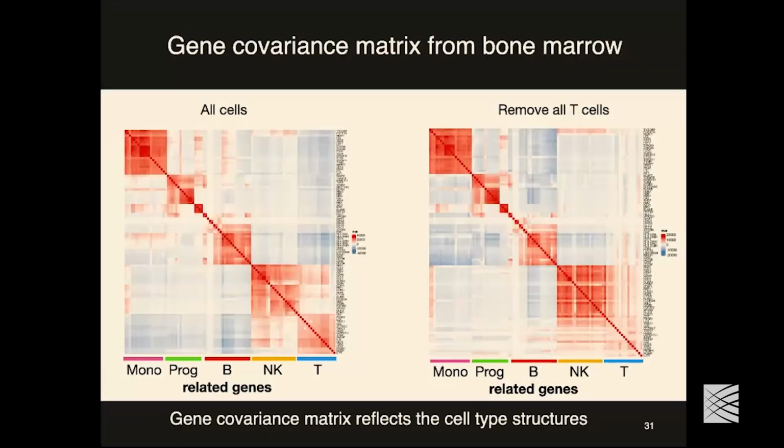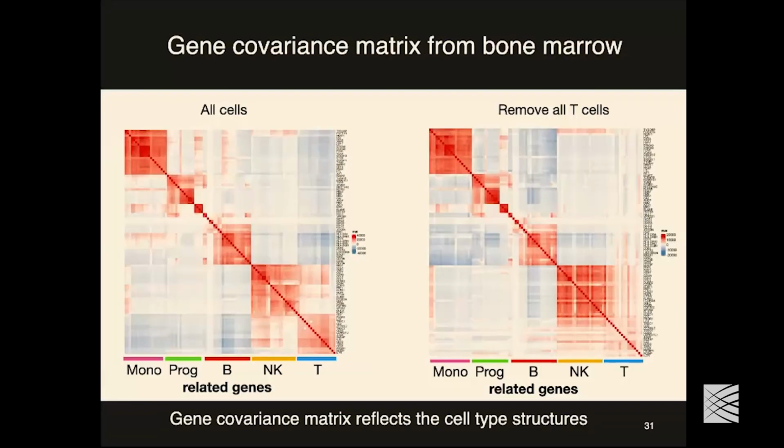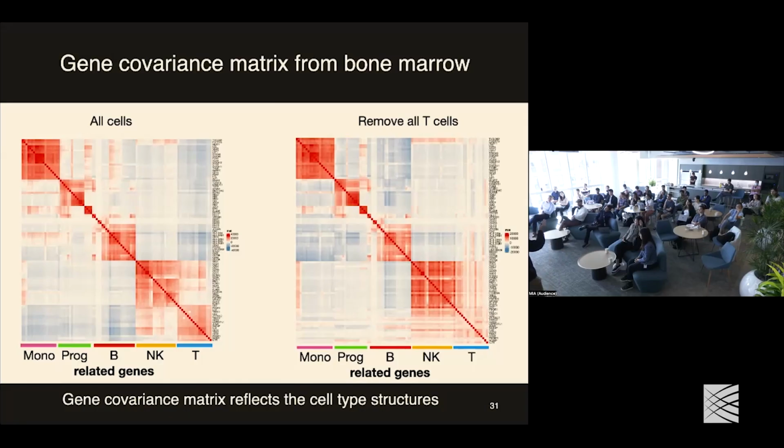I have a question about that. Do you think any cell population has a unique block in the gene covariance? Maybe not a real unique block, but they should have some signal, because we said they are unique populations, which means they have some unique gene program. Just like when we have a matrix, we can do the SVD: one matrix related to genes and one related to cells.